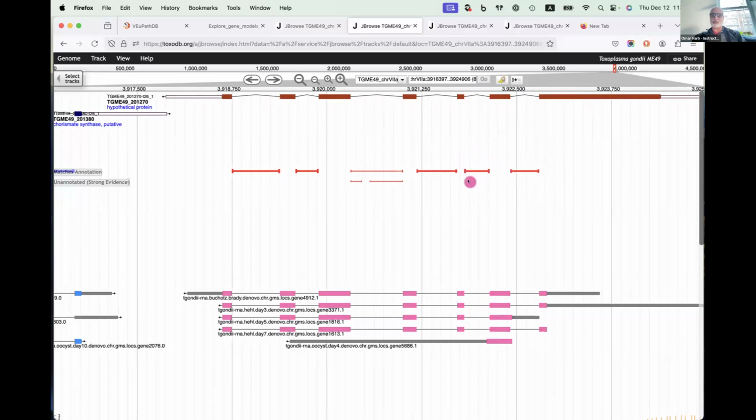And Suzanne already said this, I'll just repeat it. As you know, with RNA sequence data, you're sequencing the messenger RNA, the already, hopefully, mostly spliced RNA transcripts. And in most cases, you're doing Illumina reads, so they're short reads. You take all of these reads and you map them back to the genome. You're not mapping them back to transcripts. You don't have the sequence of all the transcripts sitting around in a file. Typically, you have a genome. And so you map them back to the genome.